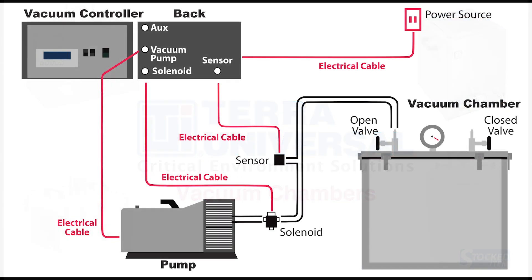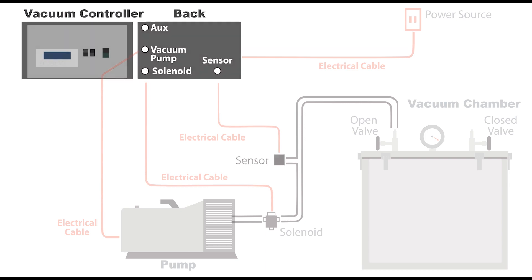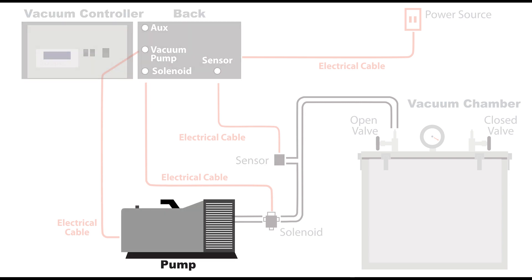In this video, the acrylic vacuum chamber has a typical full vacuum configuration, including a solenoid valve, sensor, programmable control module, and vacuum pump.